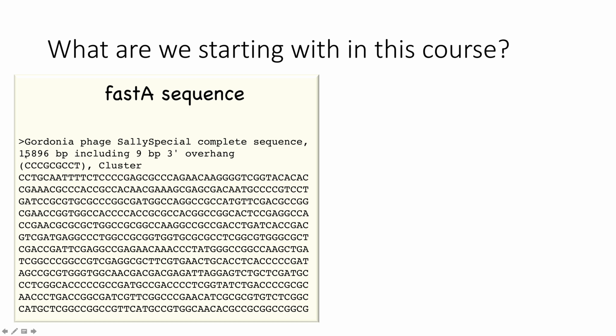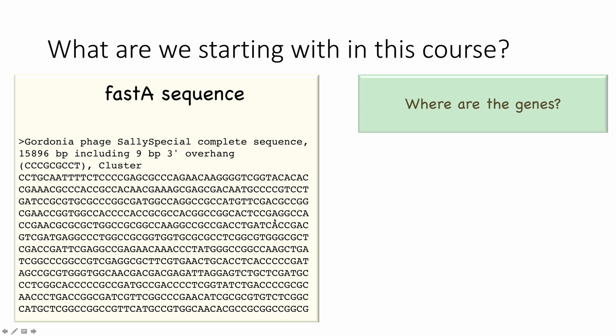Now this genome is over 15,000 base pairs long, and so obviously I can't fit that on the screen, and I've shown you just the very, very beginning of the sequence. Well, what we can do with this sequence as it is is really not much, because it's just a string of letters to us and we don't know where the genes are. So we need to take this sequence and import it into the program DNA Master.